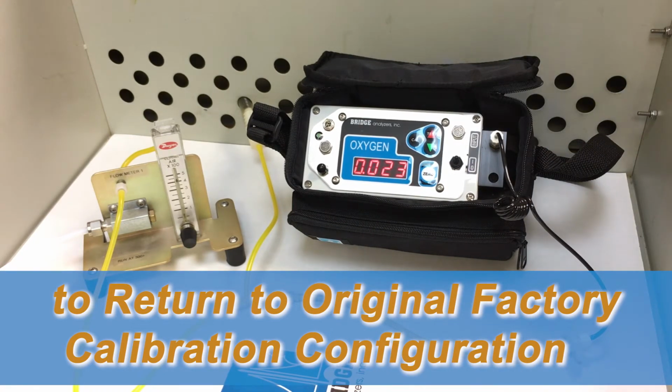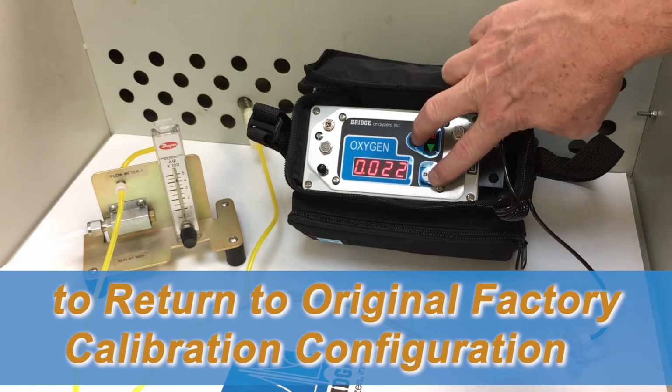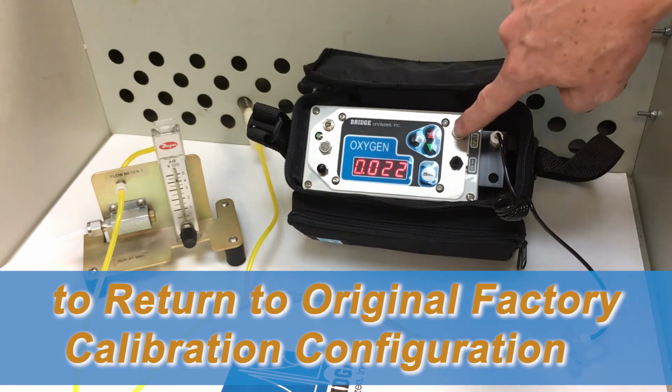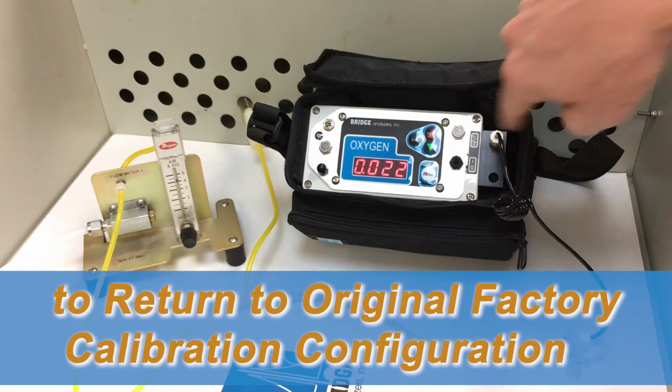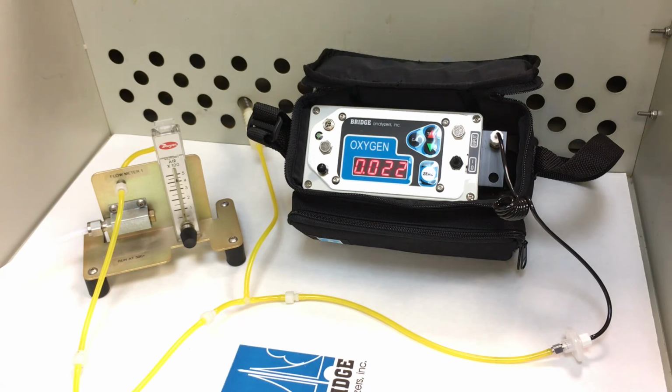And that's a way, if you think you've really got some mixed up calibrations, you can go back to the factory settings, which is again going into the cal mode, which is cal and 0, and then pressing the up and down arrows simultaneously until it pops out of calibration mode. That resets it to factory calibrations.